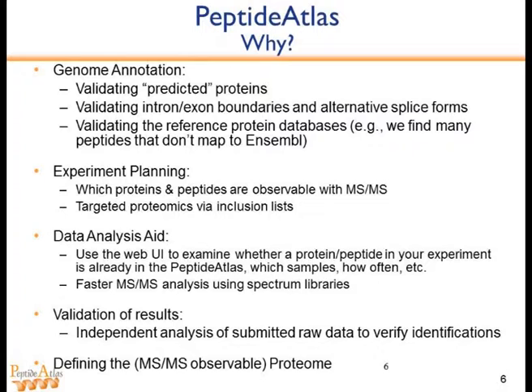We regularly find peptides that don't map to one database or another. And as I said, UniProt and NextProt, which is sort of the next-generation human form of UniProt, are now ingesting information from the PeptideAtlas to link to their resource and to offer as protein evidence.